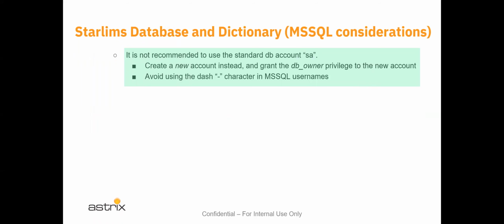When installing the database system accounts on STARLIMS application, you don't want to use the SA. SA is a standard that is used in almost every system that I've seen with either Oracle or Microsoft SQL, and it's all too easy to try to hit that and start hacking at it. Eventually, some nefarious character might utilize that account to try to start banging away at it with an algorithm detector of some sort.